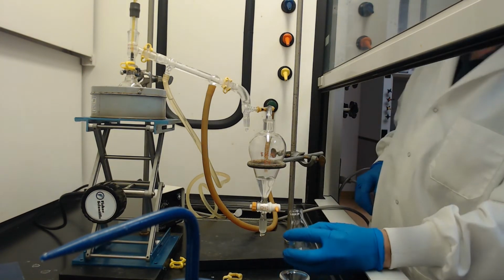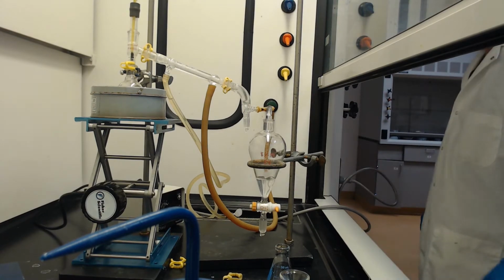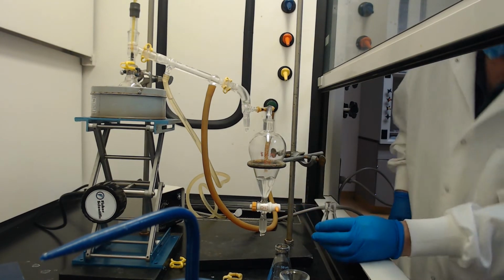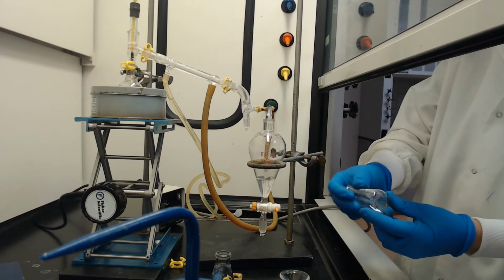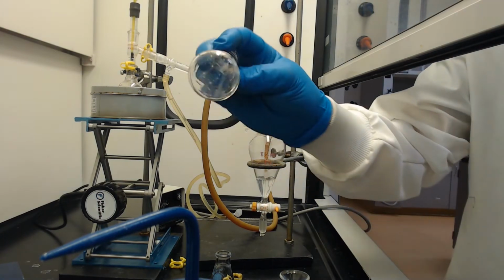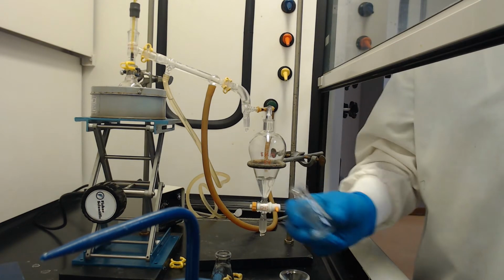So I found a nice 50 mil. We could maybe use a 25 mil. We'll use the 50. Or actually, I'm looking at that. I think the 25 one might be better, because the smaller the flask we use, the less we'll leave behind. Although this thing has a lot of crud in it and isn't very clean, so let's not use that. I see all the crud in there. Let's go find a clean one. I have a nice clean one here.